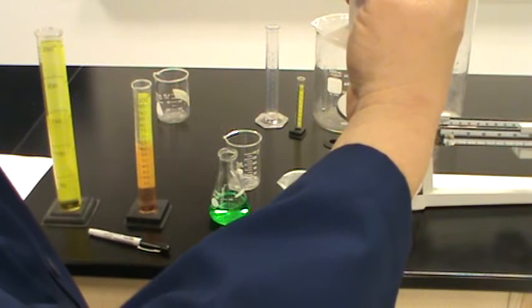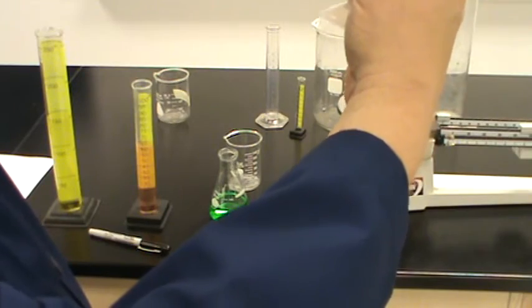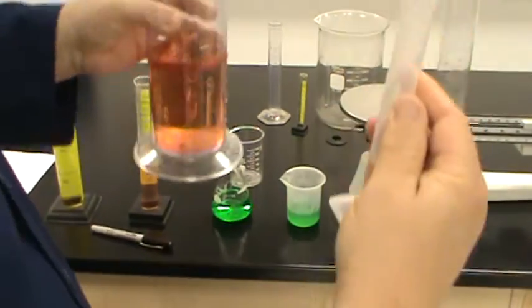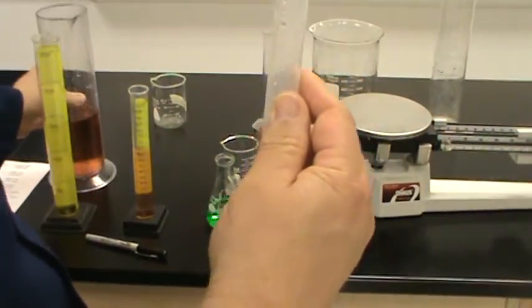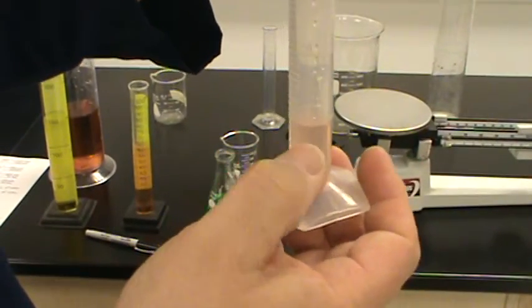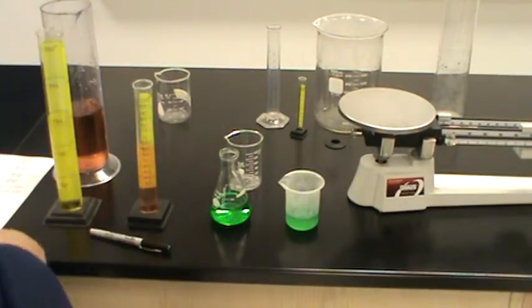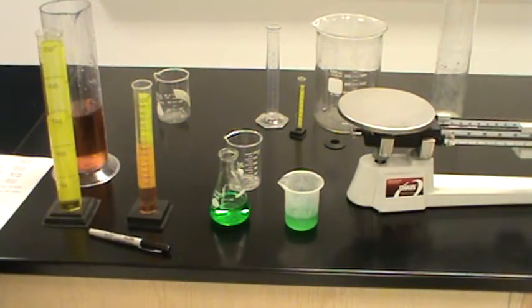I've got some red liquid made up here. And let's see if you get this right. And then I was supposed to come around, and sure enough, right here, I've got 5 milliliters of liquid in that container. And so I would come by, and I would sign off that you did 5 milliliters of liquid.